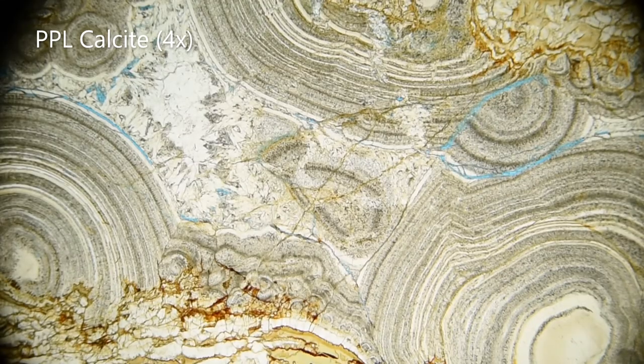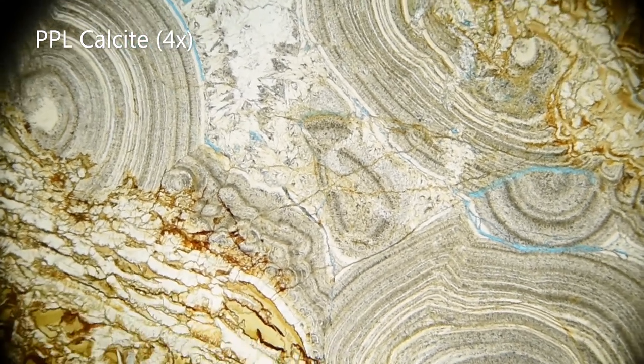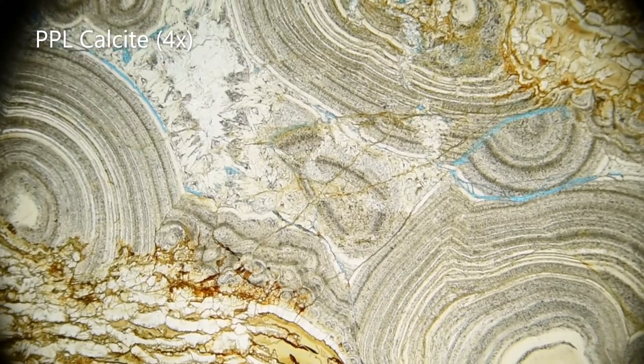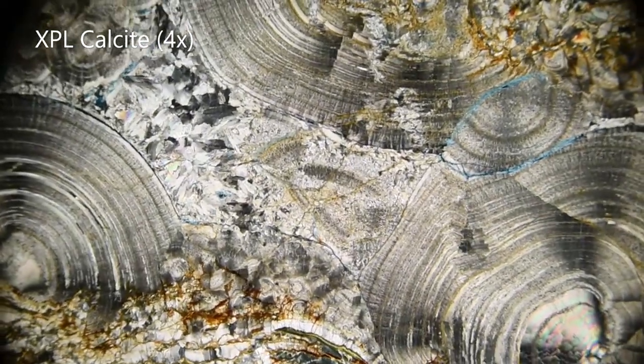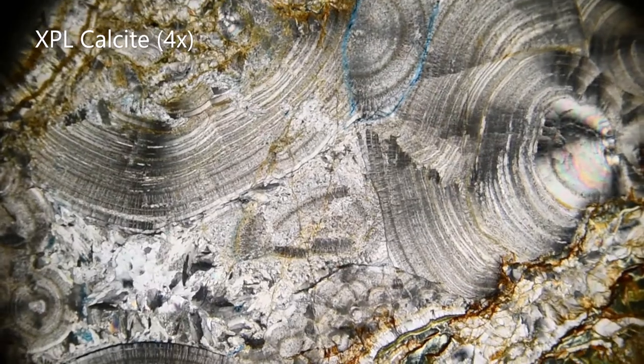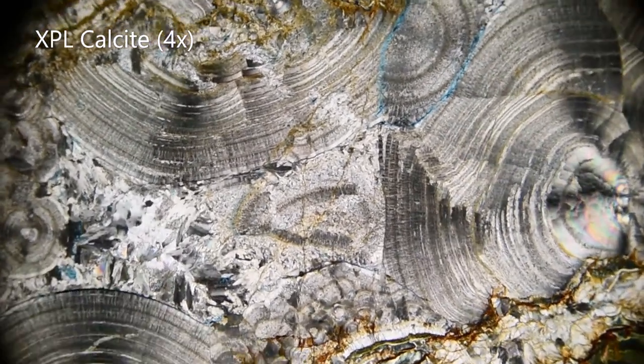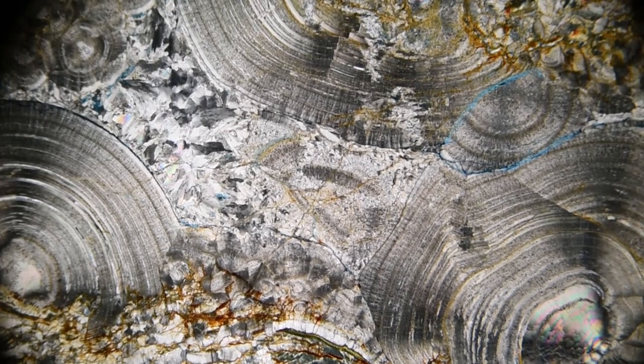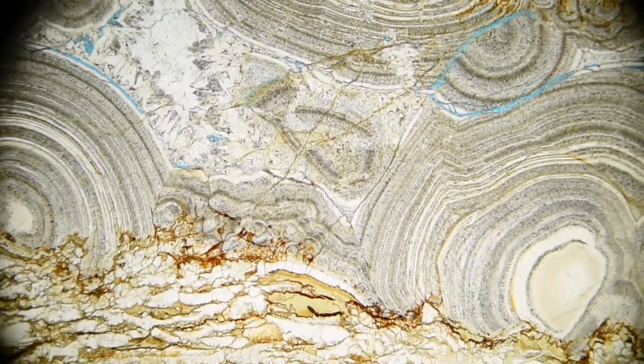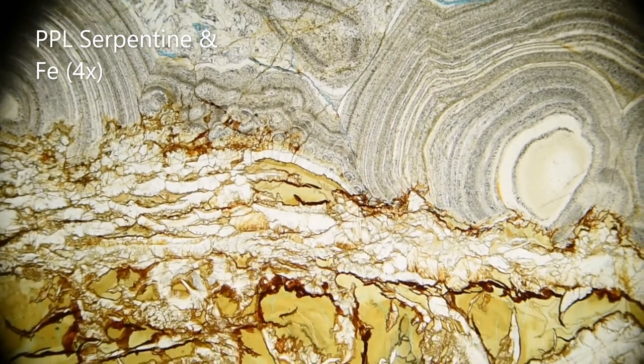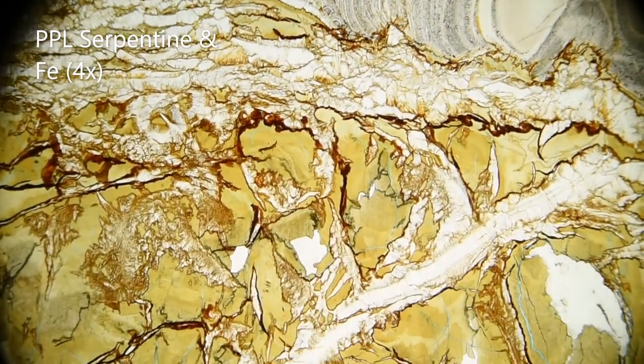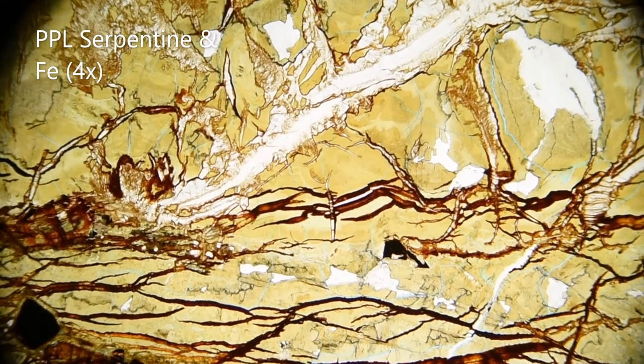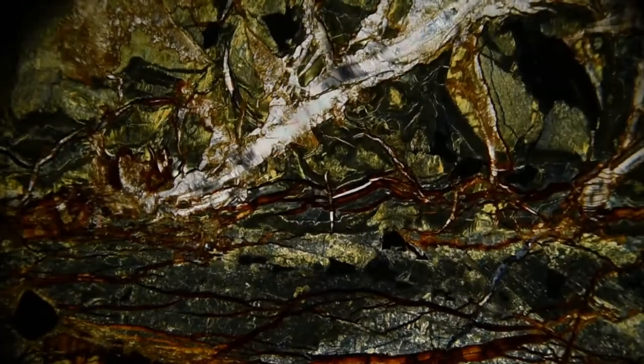This sample has three minerals which have been included in your kit. What you are looking at is a calcite vein in plain polarized light. The interference colors in cross-polarized light are very pale and almost look gray because the crystals are so fine-grained. Below is a mesh of serpentine and iron oxide. The serpentine is green in plain polarized light and grayish in cross-polarized light. The iron oxide is red in both kinds of filters.